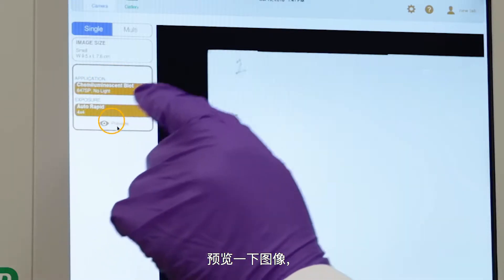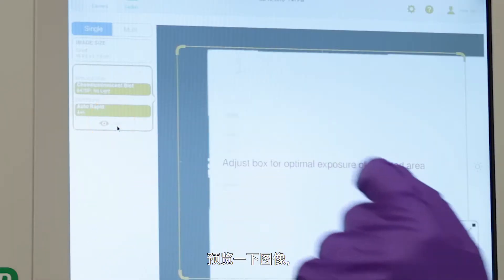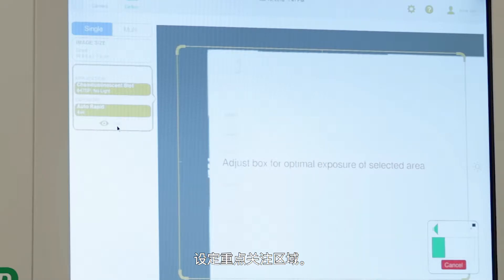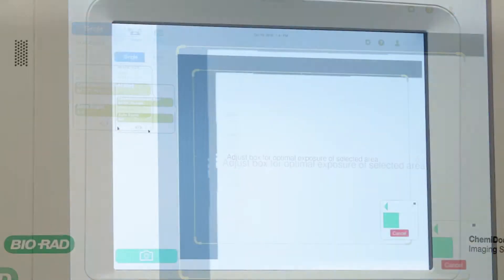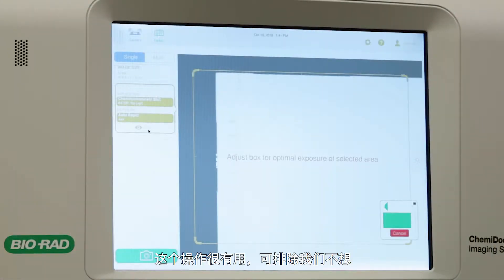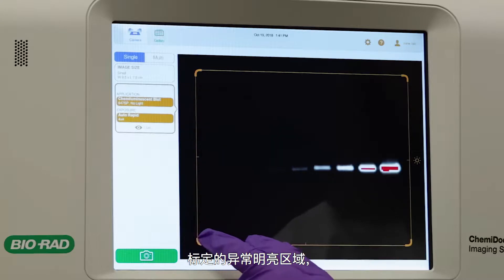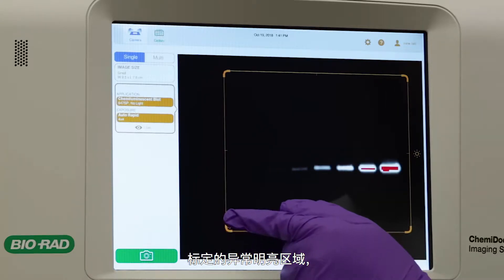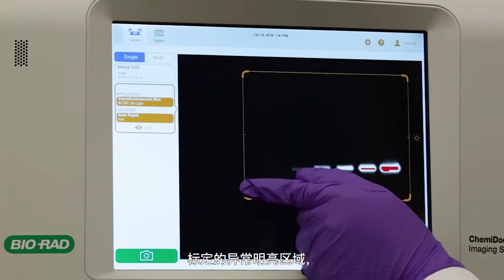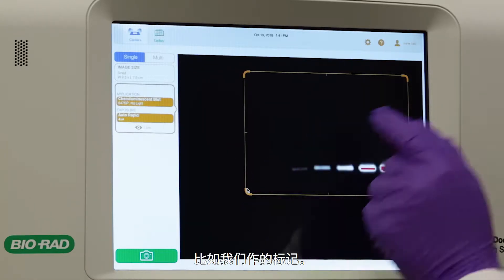Take a preview of your image and set your region of interest. This can be very useful for excluding abnormally bright areas that you won't want to quantify, such as your marker.